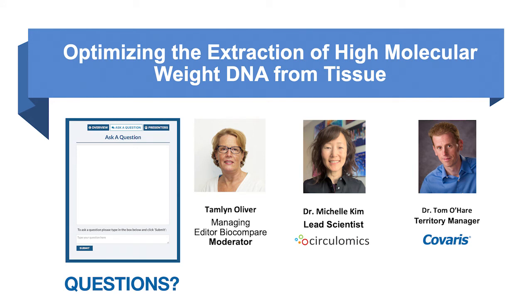But after the cryoPREP, we still need to use PCR, right or wrong? Well, that's completely up to you and your goals for your downstream workflow. If you need to amplify, then you're certainly free to use PCR. The cryoPREP itself is kind of agnostic. It fits with many different workflows, including PCR.